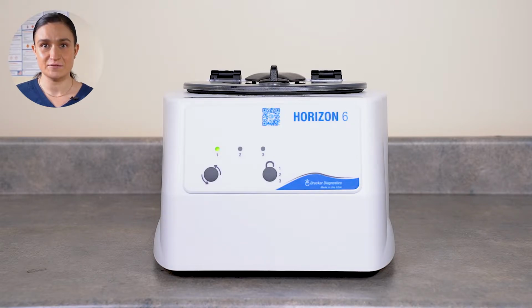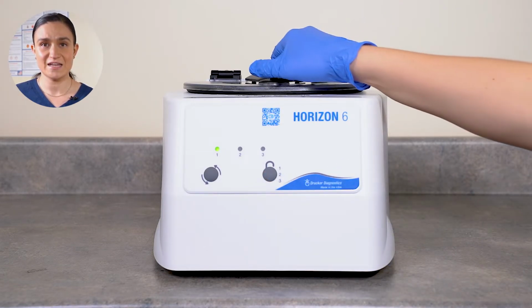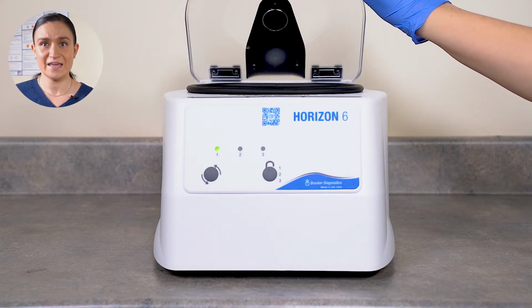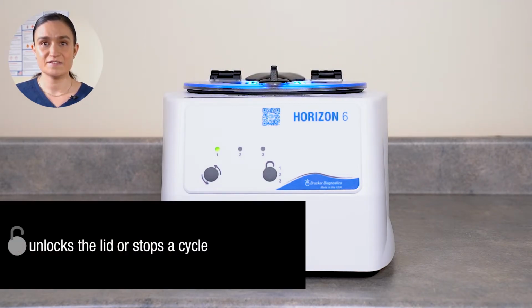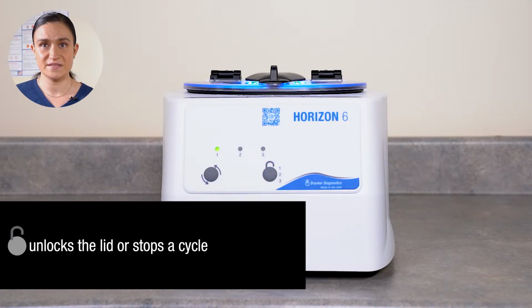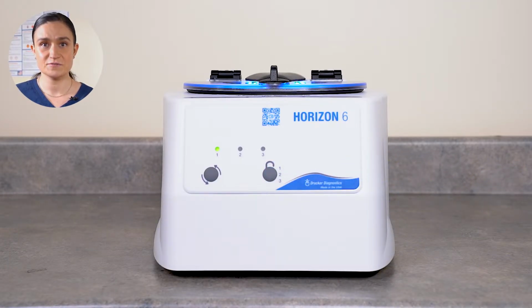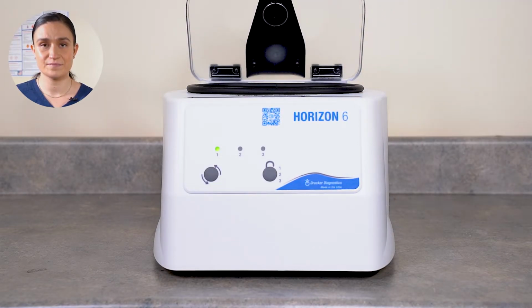Your Horizon 6 is equipped with a safety lid lock system that automatically engages between spins. Pressing Stop Unlock will unlock this, allowing you to open the lid latch and access the rotor chamber, and allowing you to select a different cycle. If the centrifuge is running, pressing the Stop Unlock button will stop it mid-spin. The centrifuge will immediately slow down, and once it comes to a full stop, it will automatically unlock, allowing you to open the lid latch.